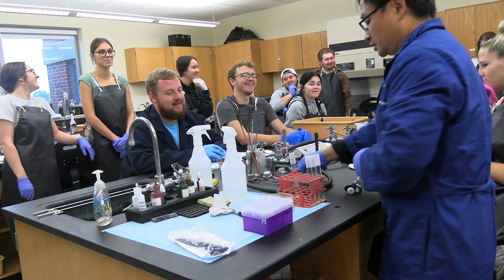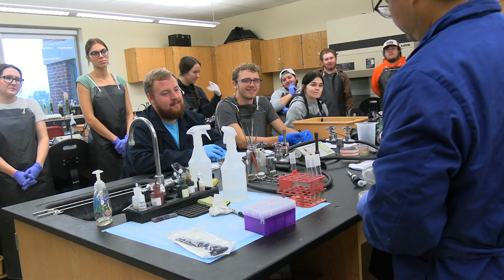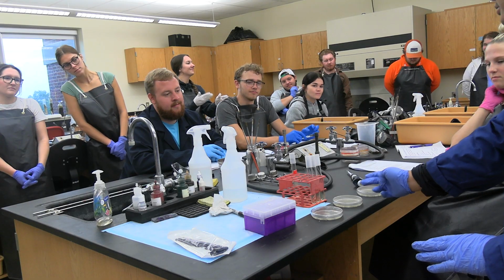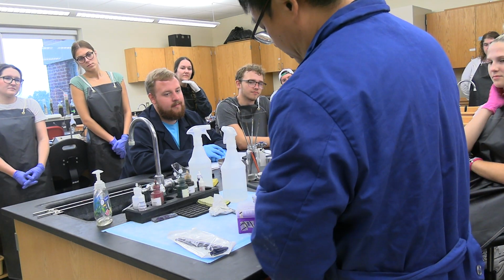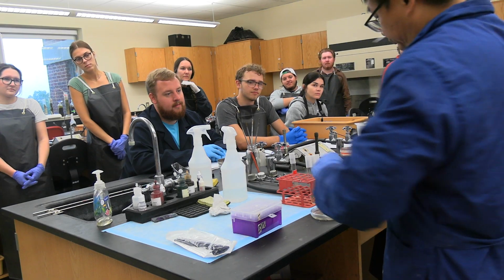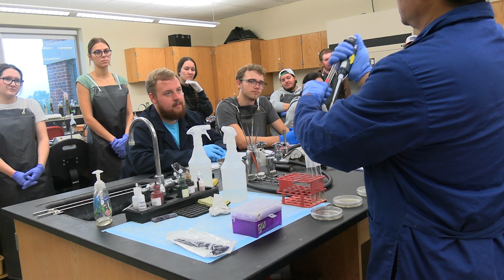That's okay. If we don't have gas, what do we do? We still can do it. First of all, you're going to arrange 10 to the power of 7, 5, and 3. If we don't have gas, we still can do it, but you have to do it a little quickly. Tips, you know how to do it. Shake 15 seconds. Let's say you shake it.